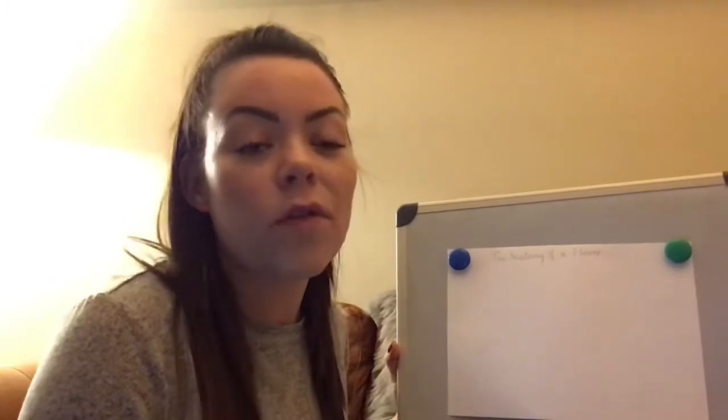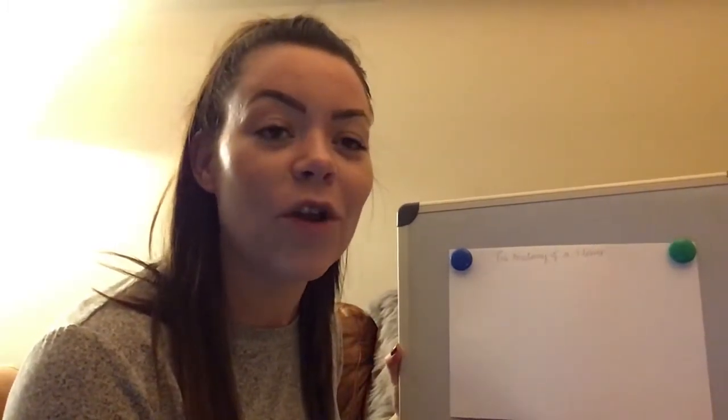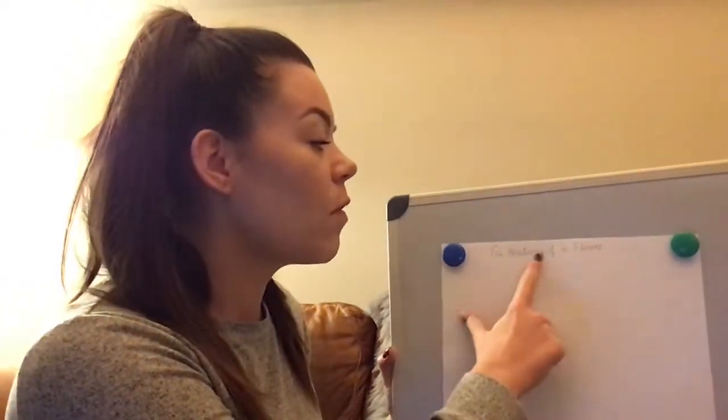Over the weekend I asked if you could maybe pick a flower out of your garden, or maybe your adult's got some flowers at home that are kind of dying a little bit so you could borrow one. That's what I've done. And what we're going to do today together is dissect it, which is a scientific word for pulling something apart and having a little look at what each part does. And we're going to dissect our flower so we can understand the anatomy of a flower.